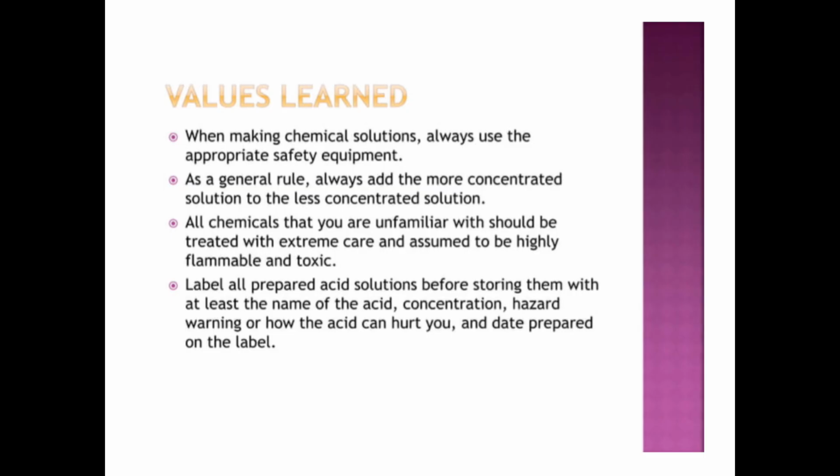Take note of that. For instance, with acid, you add concentrated acid to water, not the other way around, not water to acid.